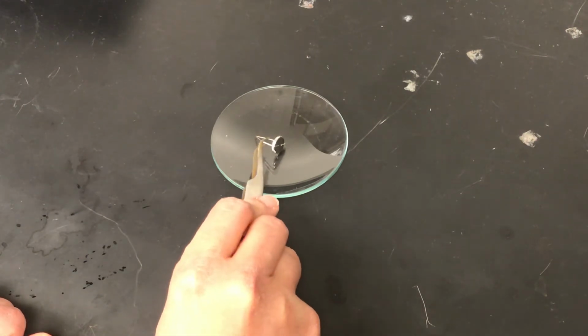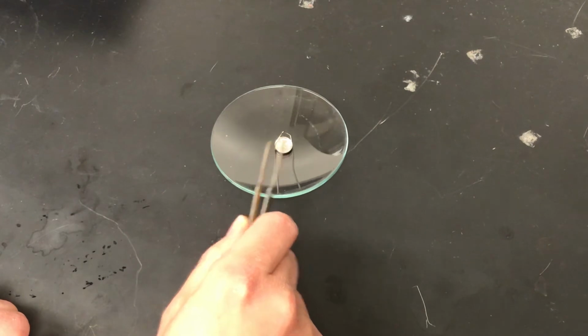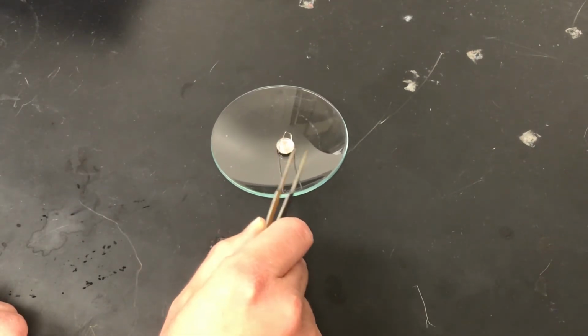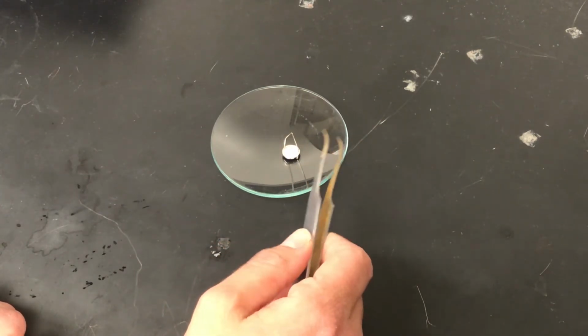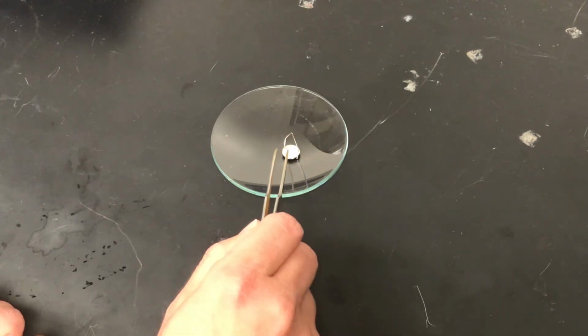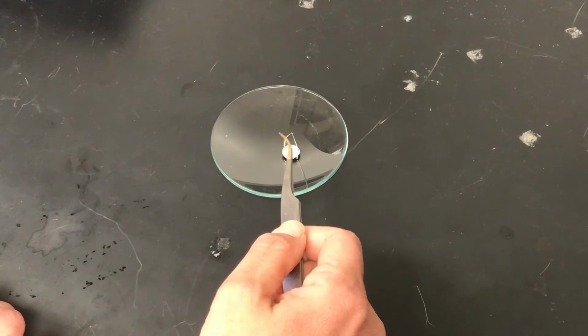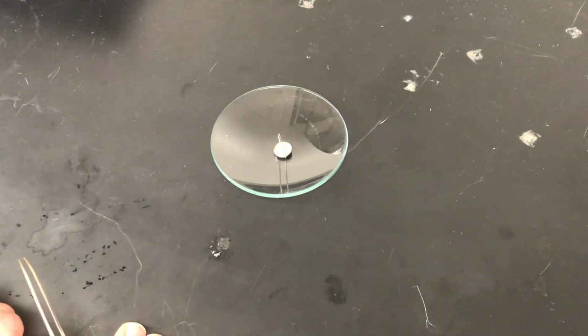Now, this pan hasn't yet been cleaned, but once we clean it, you don't want to be touching it. Your fingers can add oils to the pan, which will affect the mass and will affect the measurement. As those oils burn off in the instrument, you'll see a change in mass. So we're going to be really careful to only use tweezers, forceps when we're handling this sample pan.